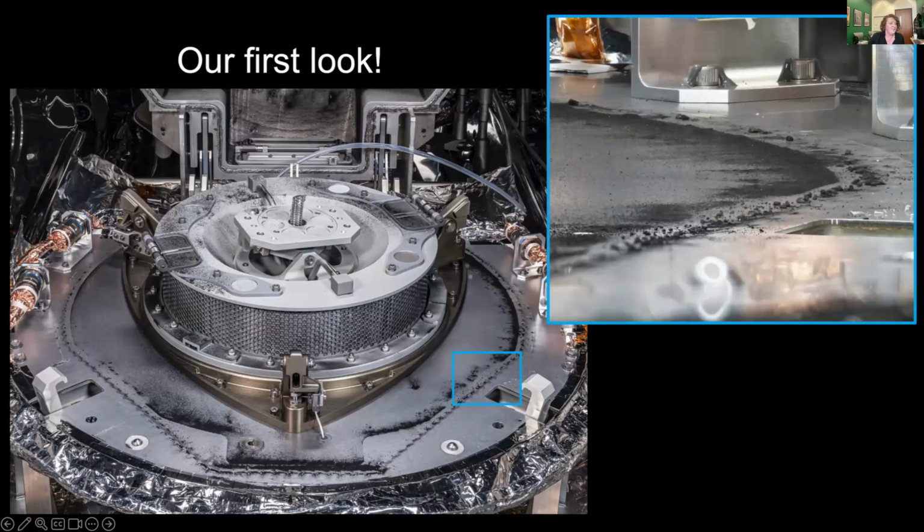So the circular feature is the TAGSAM. That has where all of the bulk material from that really aggressive sample collection event was contained. However, what you might notice is that there's all this dust and dirt sitting on the outside of what we call the avionics deck. Here's a view looking obliquely at that material. This is all particles from asteroid Bennu.